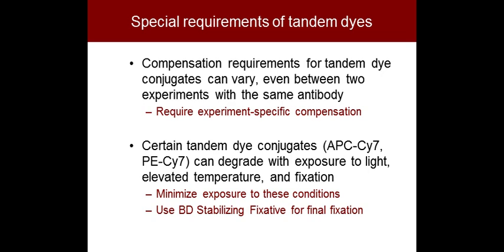But the bottom line is that if you're using these tandems, you probably should do your compensation experiment by experiment, or else you may see some drift over time. And it's a good practice to do that anyway. So that's the first point. The second point is that the Cy7 tandems in particular degrade with light, temperature, and fixation. So you really want to minimize your exposure to these conditions. And there are some solutions out there.